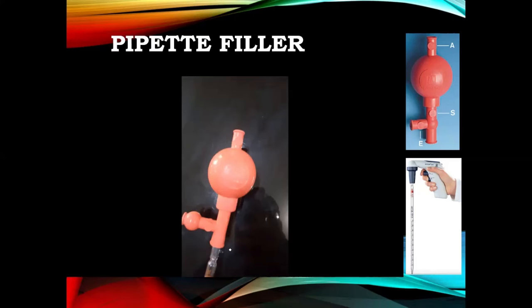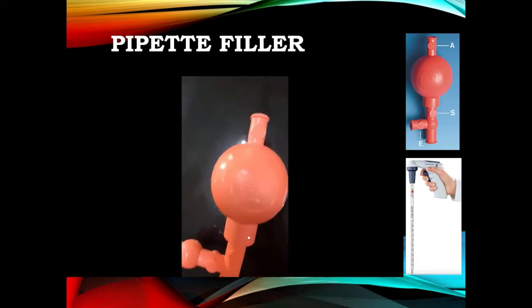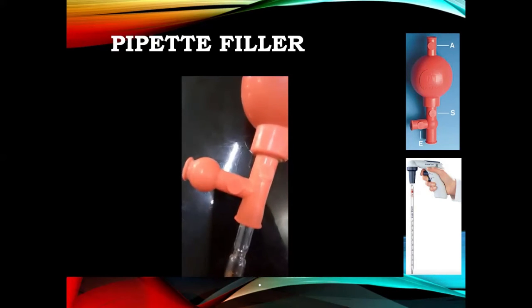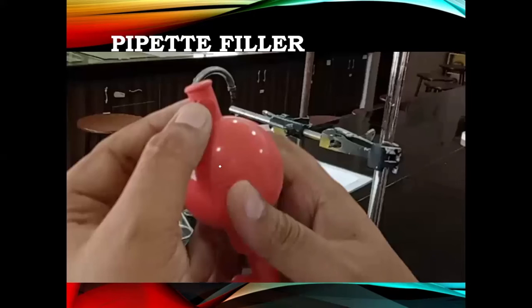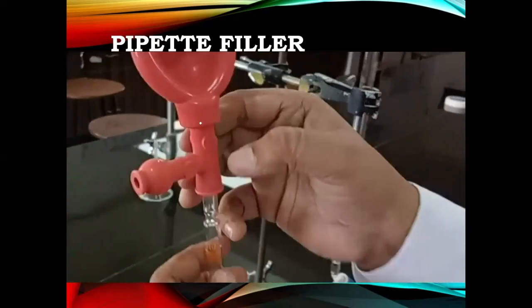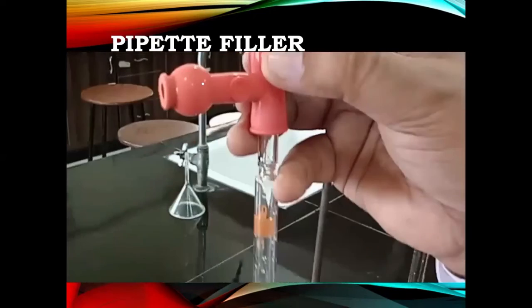See this short video as well. This is A, this is S, and this is E. Now see its function here in this video. First, we press A. Now see, when we press A, it is squeezed.